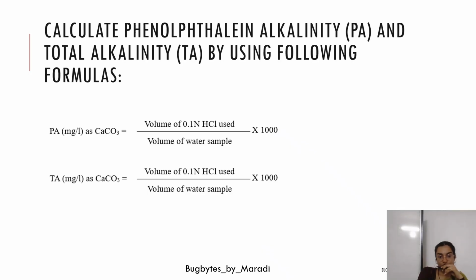I hope that the protocol is somewhat clear for you. Now, to calculate the phenolphthalein alkalinity as well as total alkalinity, that is PA and TA, we can use this particular formula. Okay, so you can pause the video and you can take it down, or you can take a screenshot.